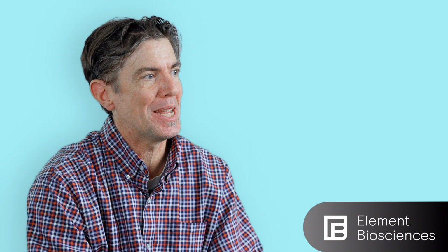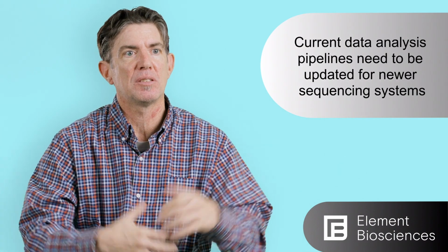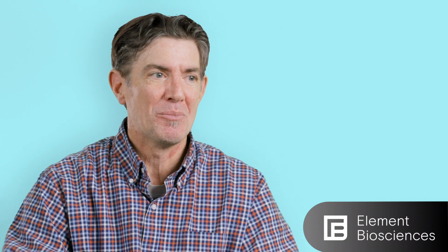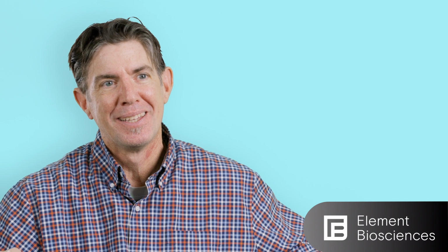And that opportunity, we're hoping people will start moving in that direction to stand up to the qualities that these instruments can now provide, and hoping that that's going to change the game in how we look at data and what determines how much accuracy is enough. I think most of the time people look at accuracy as being enough because that's what they had to work with. And Q30 accuracy and the number of redundancies that you get on reads, most people say that's good enough. And it may be.